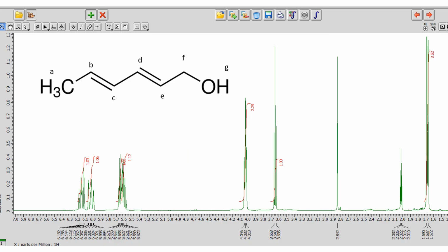Okay, I wanted to just show you, there's something kind of confusing in the pre-lab. I'm afraid my wording is going to confuse you, and I want you to understand. What I'm going to ask you to do is to try to assign the peaks in your product, not in this, in the product. But I'm going to show you that it's really hard to do that because all of these are kind of like the ones in the product. They're all very similar.